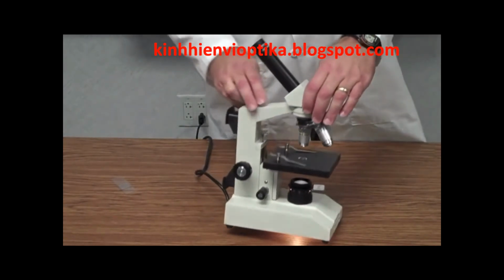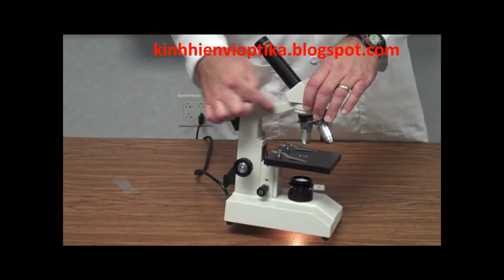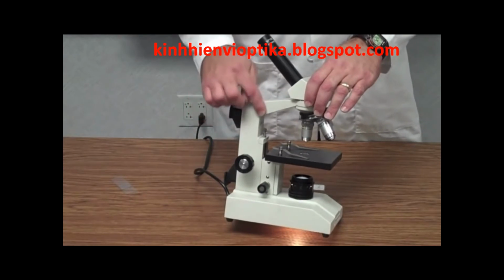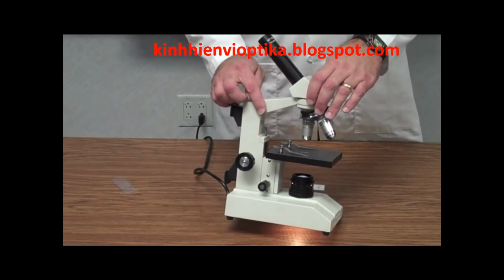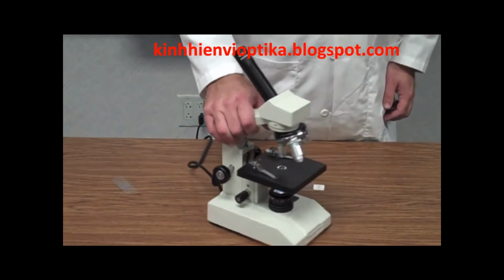And then lastly we have this part right here. This is called the arm, okay, of the microscope. This is important because this is how we carry the microscope, which we'll talk about here at the end of the video. Okay, so those are the parts.